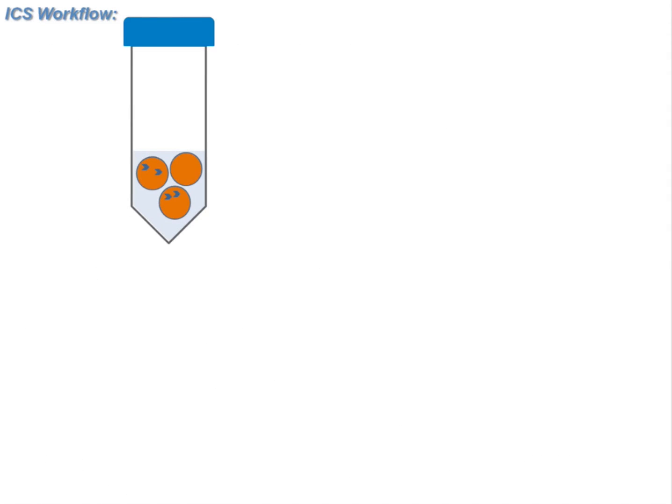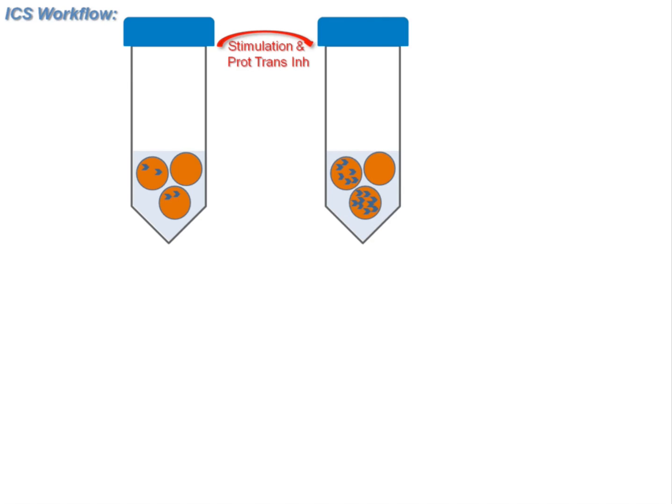So let's maybe take a look and summarize, or perhaps review, what's involved in intracellular cytokine staining. So if we take our cells ex vivo or after culture, and we have them just resting cells, we might have a small bit of cytokine being expressed within the cells. What we'll do is we'll stimulate those cells, and then we'll also protein block.